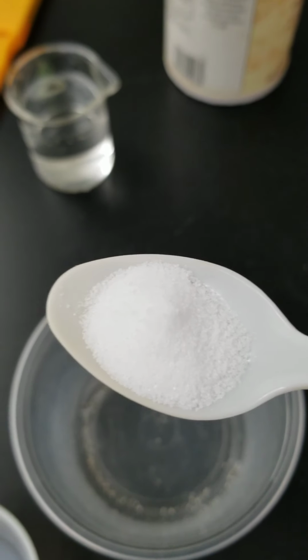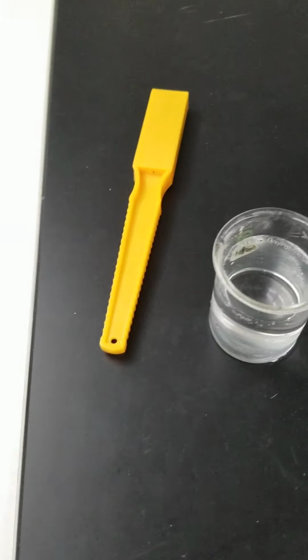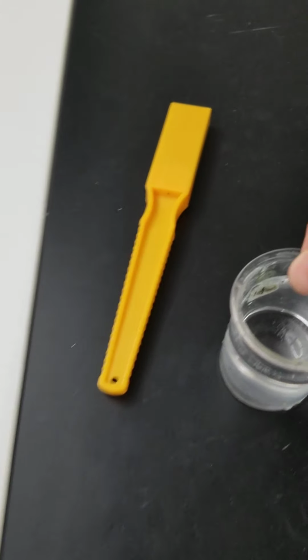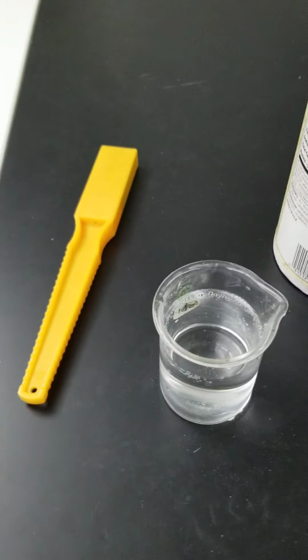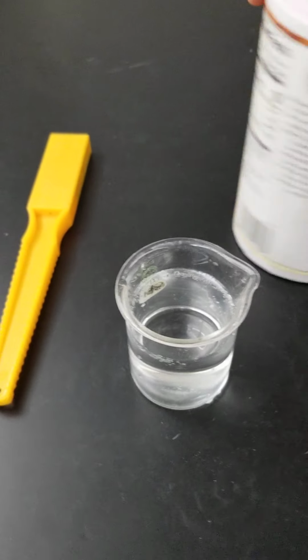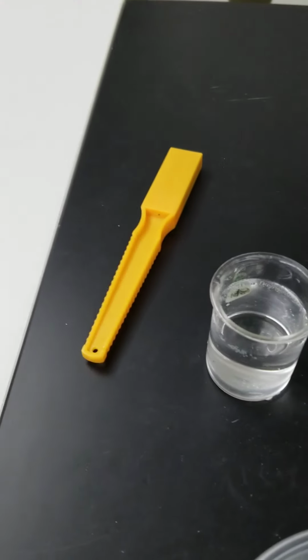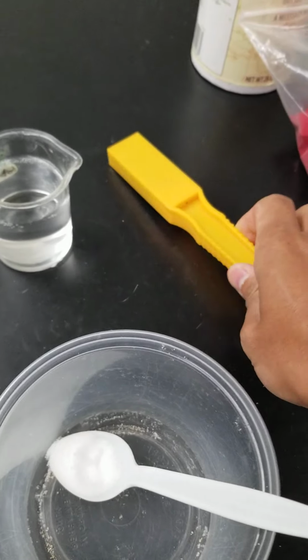So here's our salt. You can describe its particle size based on your own understanding. I'm going to add a little bit into our water there. So make a decision on whether or not it floats, or if it's soluble or insoluble. And this is just regular salt that we're using. The other thing we can do is test. This is a magnet, and it does not look like it picked up anything.